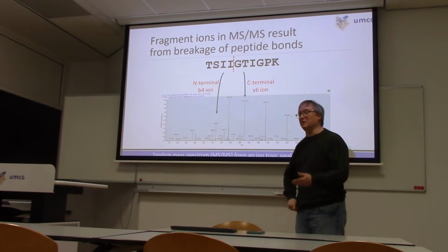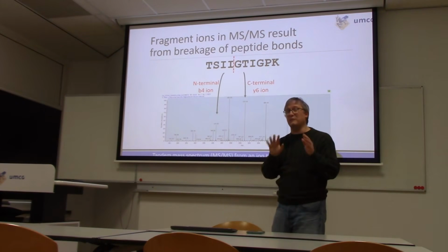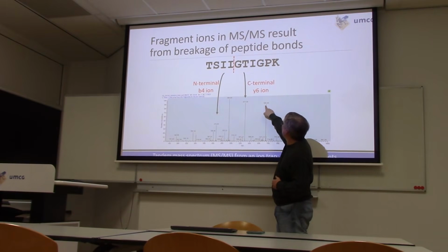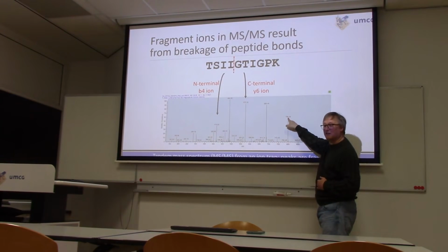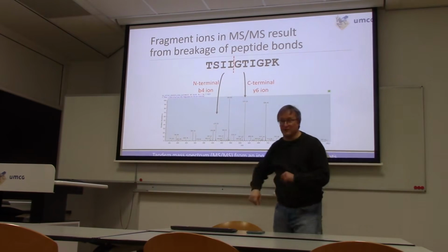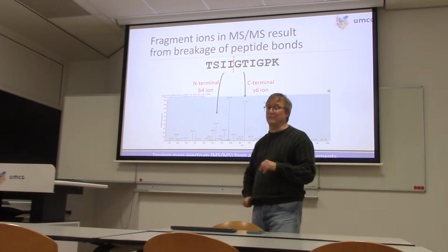One of the things you should notice here is that some of these fragment ions are going to be quite intense, but just because a fragment ion is possible does not mean you're always going to detect it. So if we were to say the Y6 ion and the Y7 ion are present, maybe we can add another 113 to this. 685 and 113 should give us 798, I think. 798. Okay, so the Y6, Y7, Y8 series is all visible in this MSMS. And that should give us some confirmation that this peptide sequence really does belong to this MSMS.